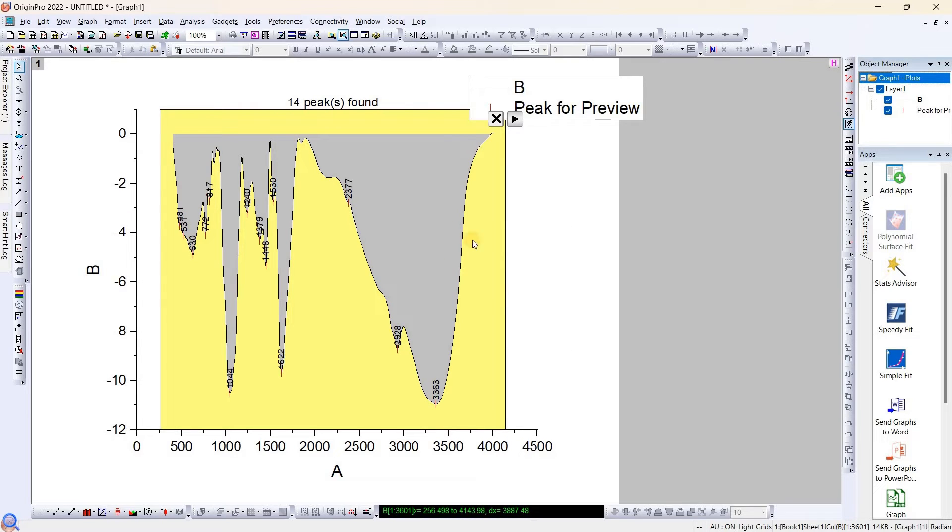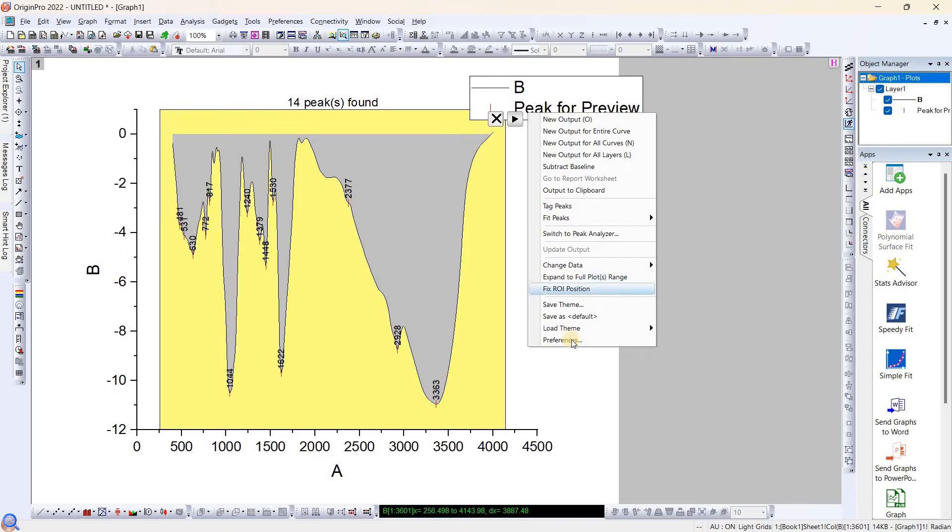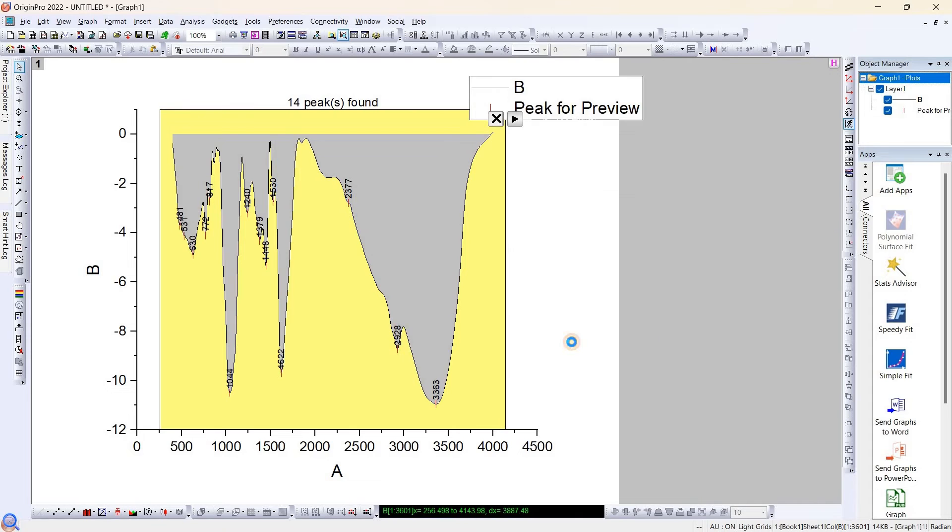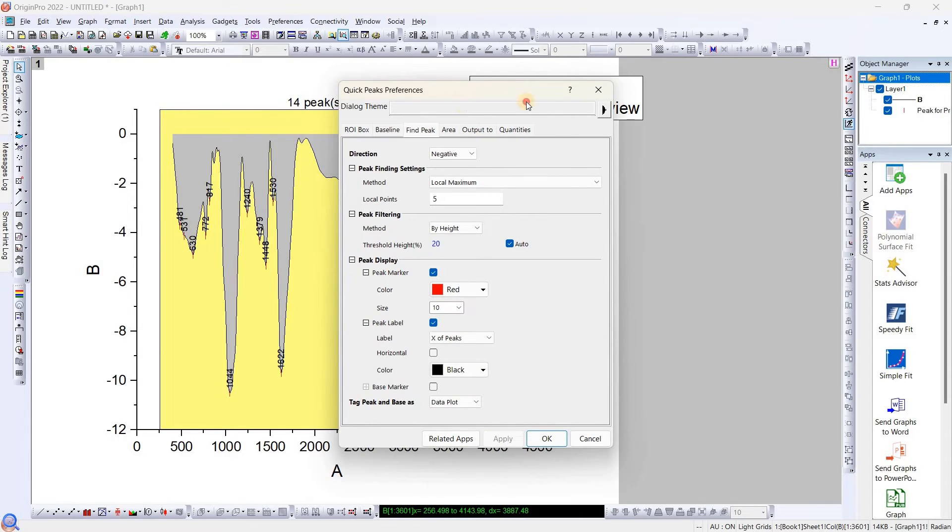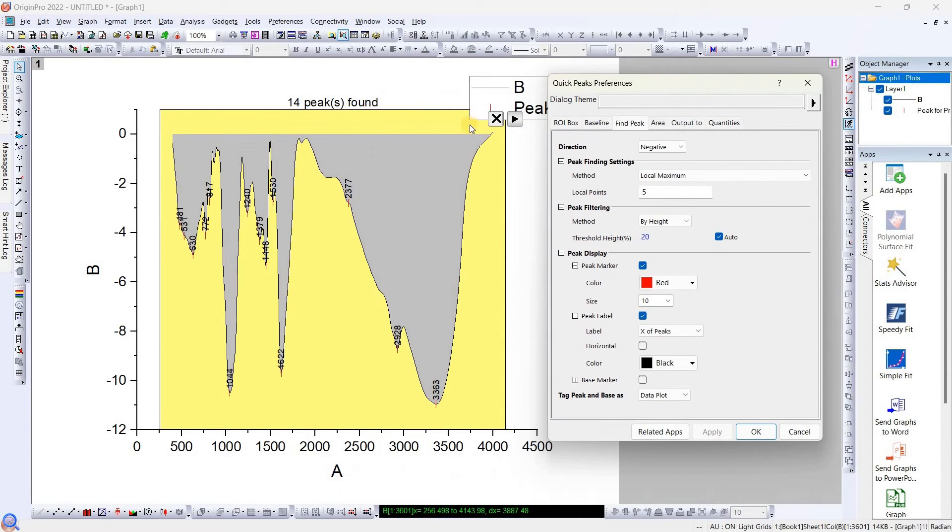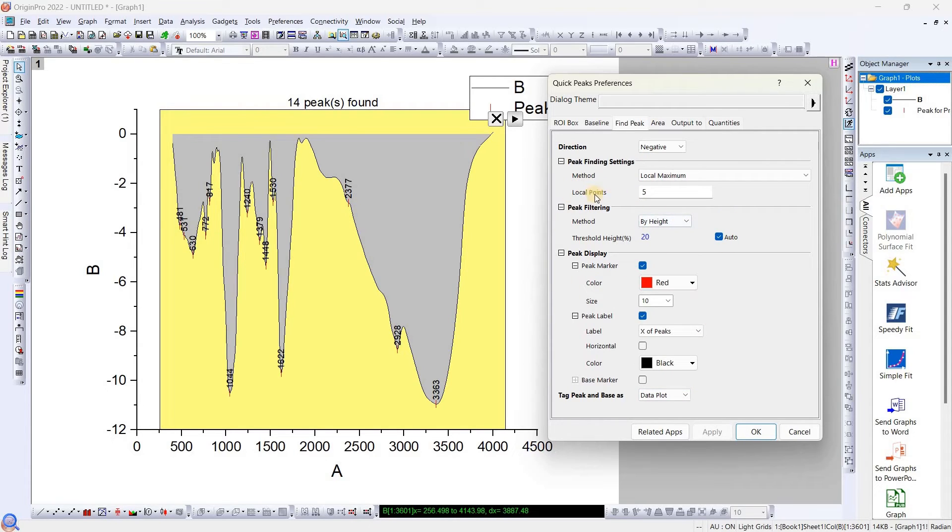They have expanded it. Now here also we can see they have selected a few ripples, so we don't have to worry about it. It can be easily changed. Go to the preference and open the dialogues. Here we can see Local Point. Once you increase this one, I will go to 20 and apply.